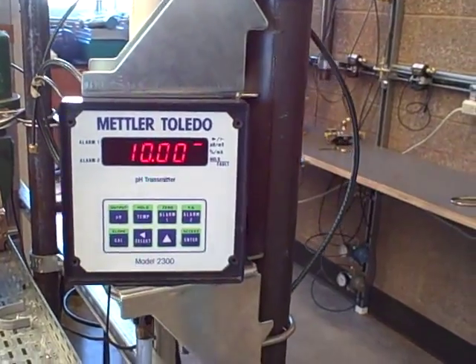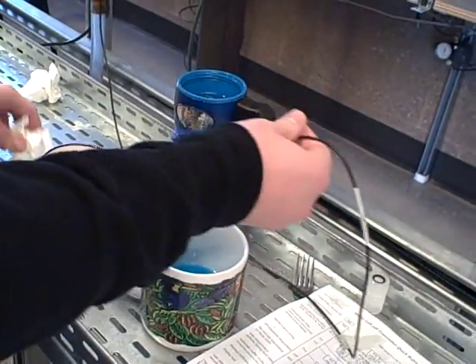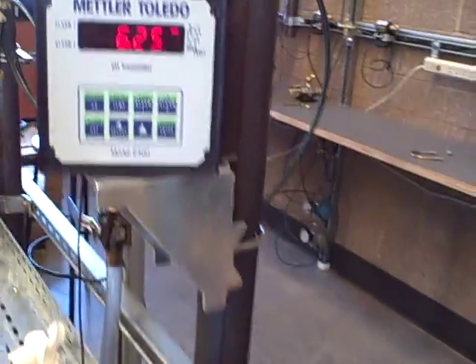And that's that — it's calibrated. So you want to test it now? Yeah, I'll test it. I'll put it back in the pH of 4, and hopefully it registers 4.